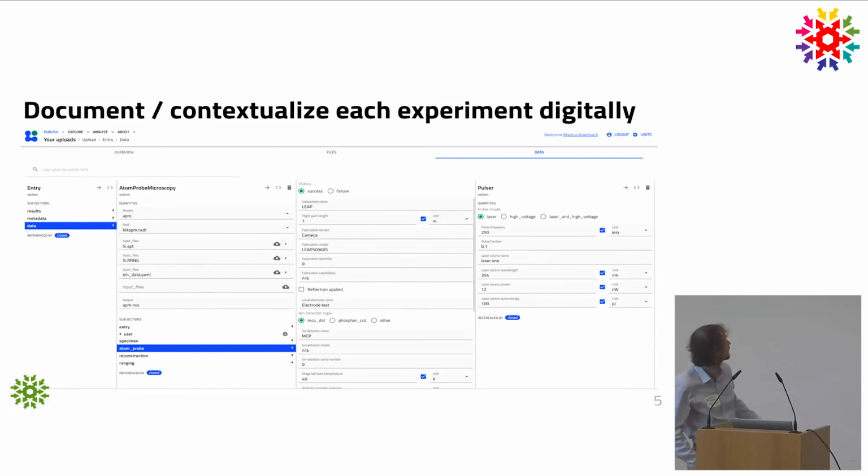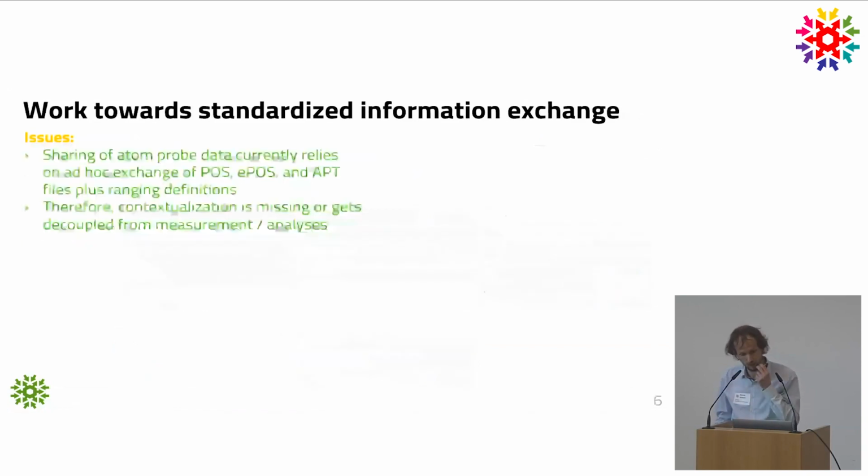And then you can decide, okay, where were my pulser settings and where were my instrument settings. Ideally, this would come directly from the commercial vendors. However, the problem is they're still in negotiations in the company whether they are willing to open their proprietary file formats for us. It's so simple. And I cannot tell you more about that. That's a process that takes long, but the next opportunity will be the APT&M conference in August, where we again will meet them, and hopefully the more we ask, the further we get with this.